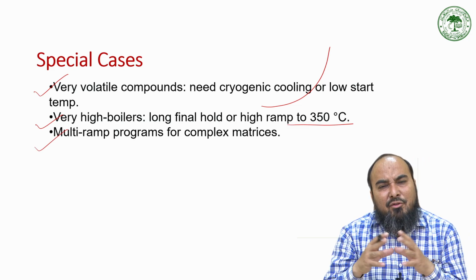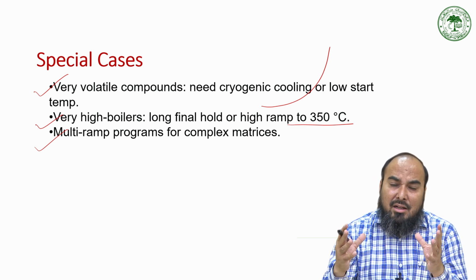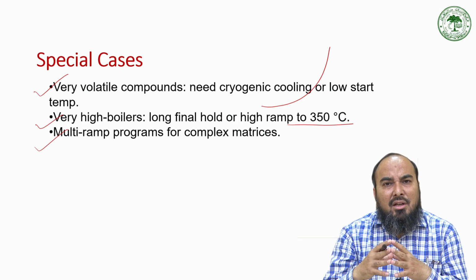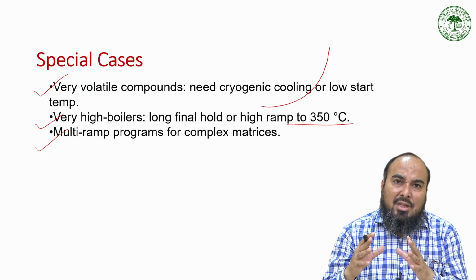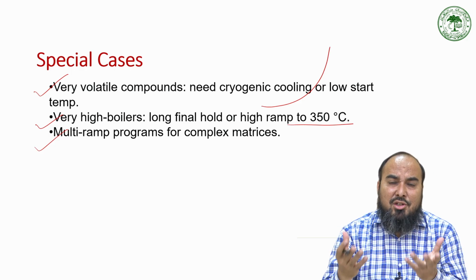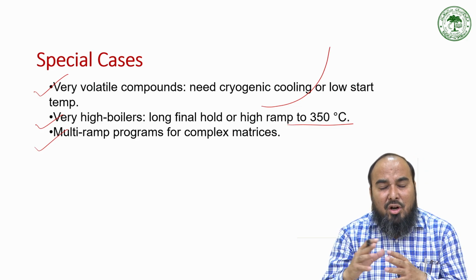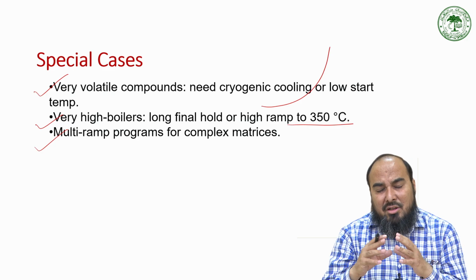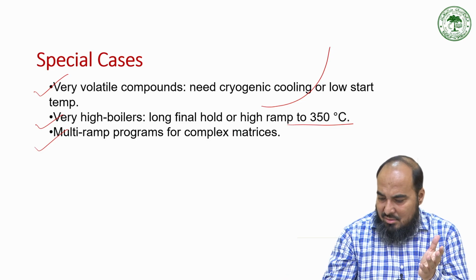Similarly, if you want to separate some corrosive substance, then you have to use some Teflon coating. So in each case, the moment you change the case, the conditions will change, and the precautions which you have to take will also change. Similarly, if you are using an FID, then you have to look at controlling the explosive mixture. So every time the condition changes, the precaution changes.